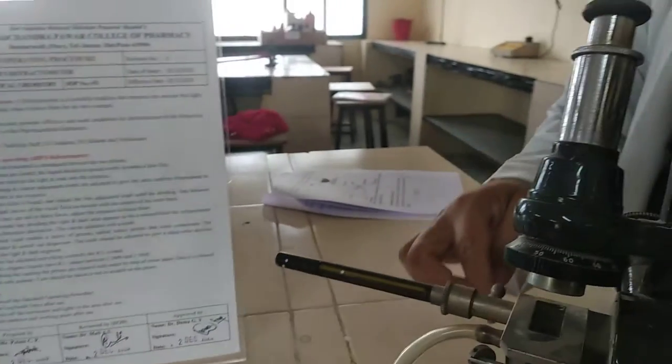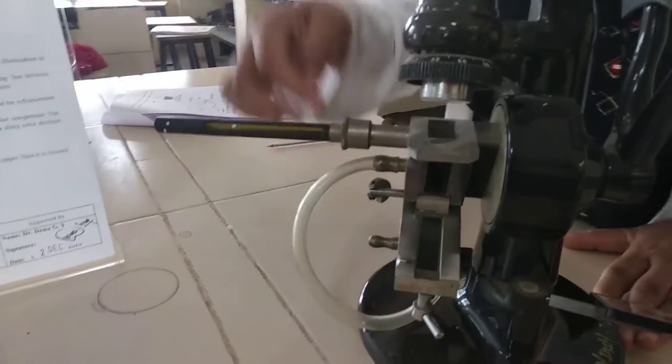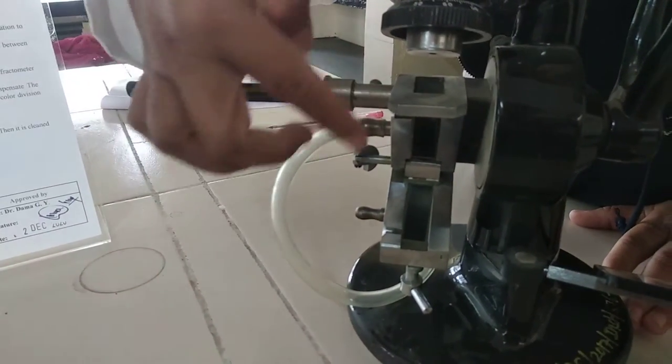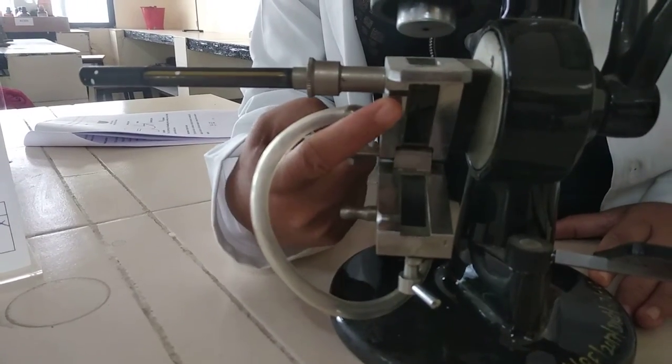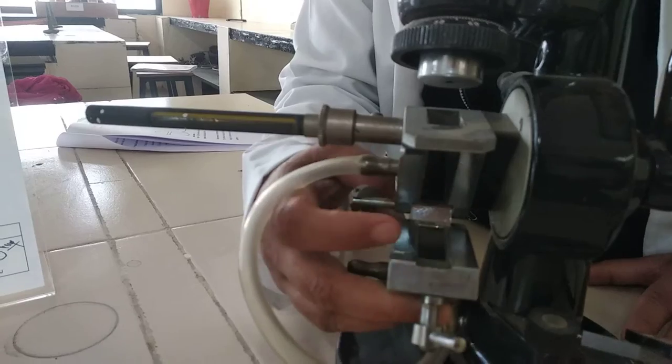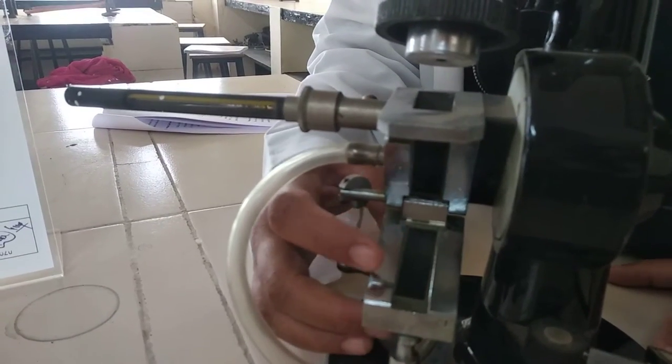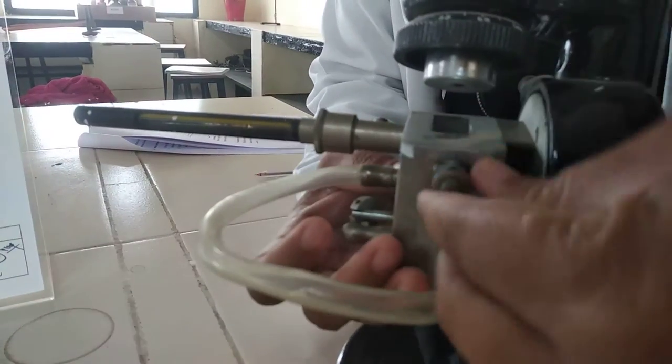First I will introduce you to refractive index and parts of the refractometer. It contains prisms, there are two prisms. This one is the first prism and second prism. Here in the first prism surface, we will apply our sample. Afterwards we can close this.